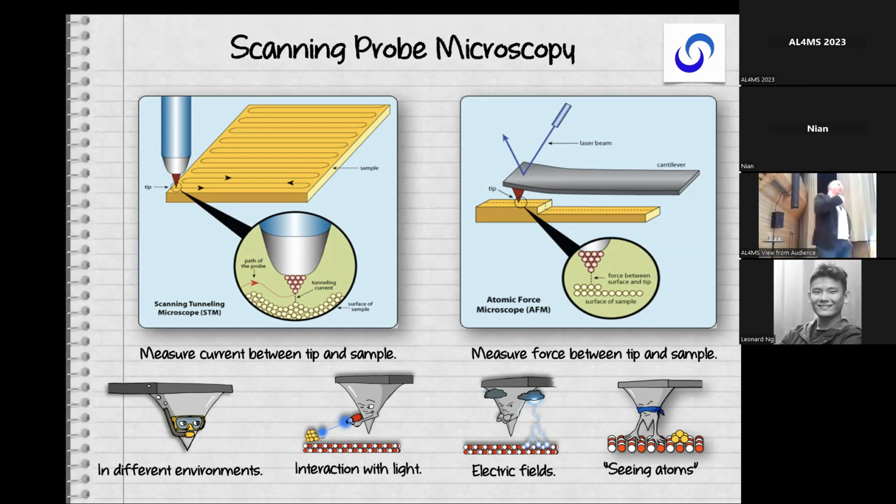Surprisingly, often in terms of material science, the sister of this, atomic force microscopy, is actually much more widely used. This is the technique that's used in biology and biological physics for looking at materials at larger scales. But I'll show that it also can be brought into the realm of atomic resolution with some advances in the last 20 years.